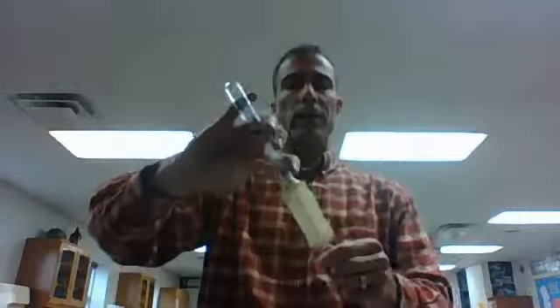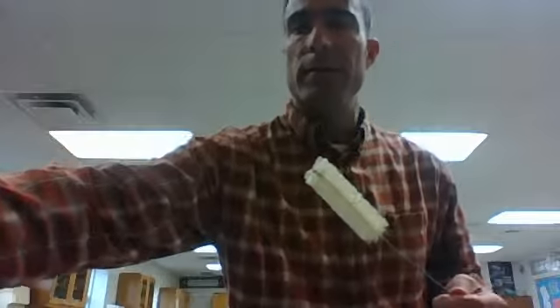This is a test tube brush cleaner, and you can use that to just simply clean out your test tube. You just put it in there and scrub it, and that is what this test tube brush cleaner is for.